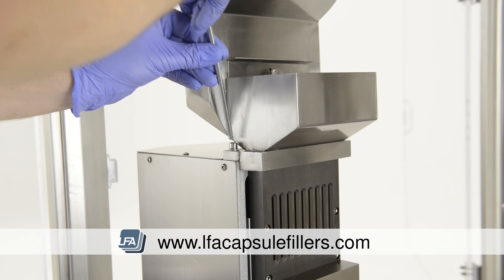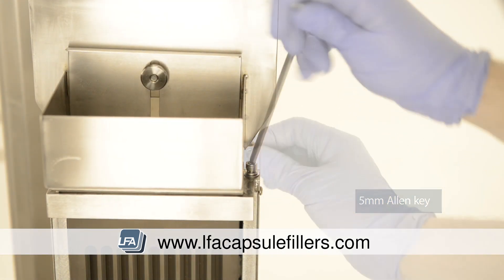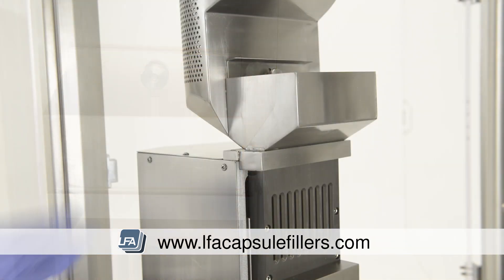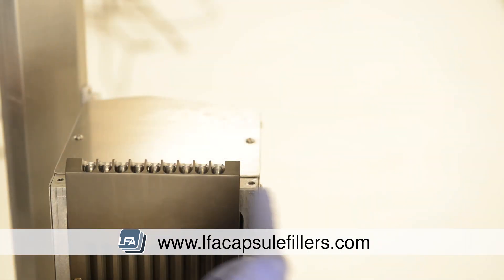Next we need to remove the hopper from the top. Remove the two bolts at either side with a 5mm allen key. Once removed, lift the hopper upwards very carefully so as not to damage the leading edge of this section, as they're very fragile.